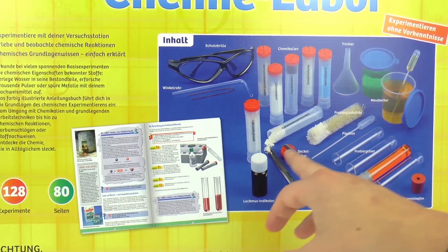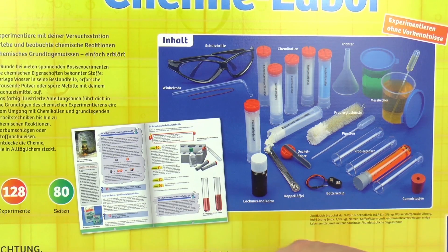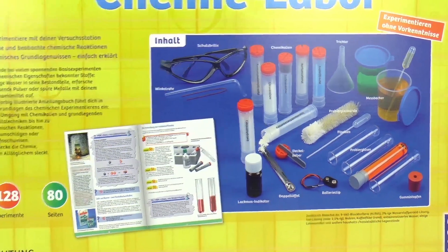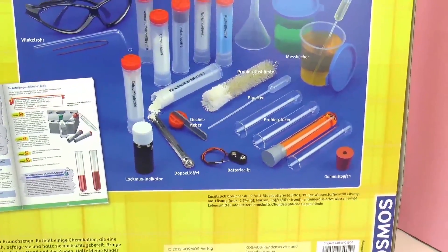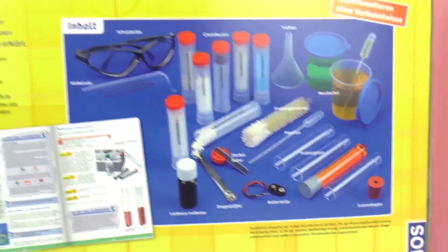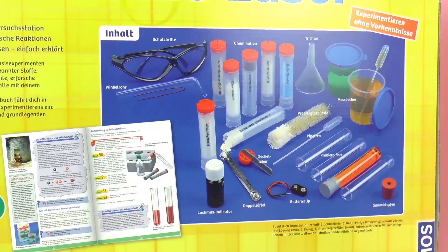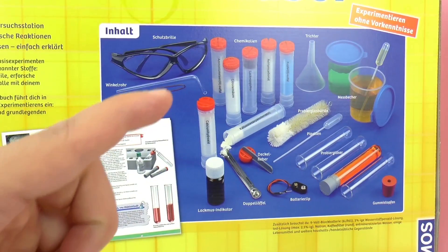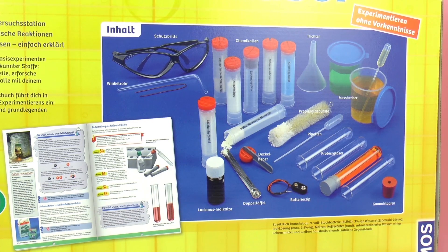It looks like the book included also has lots of pictures which will help to explain all the different materials inside. In school, chemistry was one of my favorite classes. So I'm really excited to show this kit to you guys and hopefully it'll bring science to your houses and really make you enjoy science. It could also be helpful before taking a chem class, just so you have some previous knowledge.